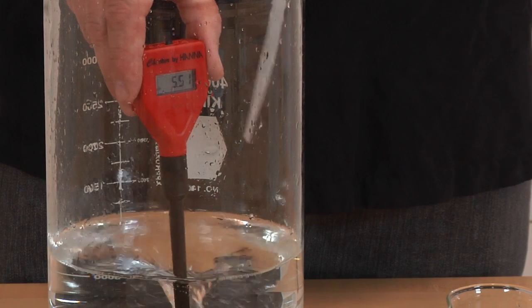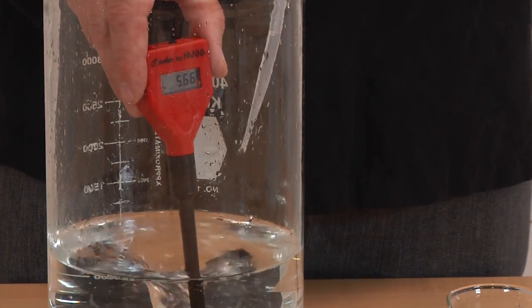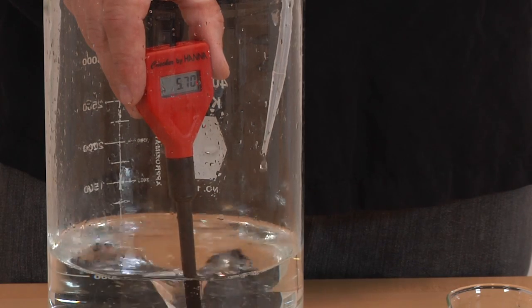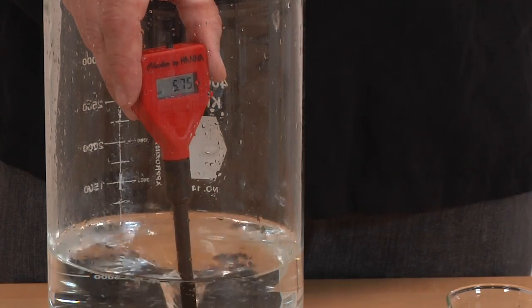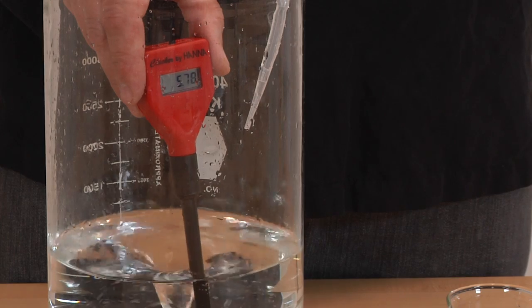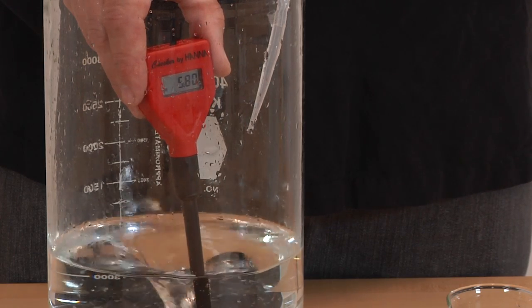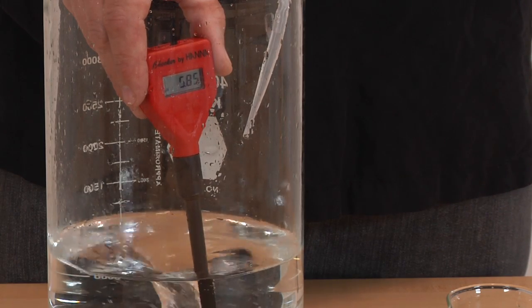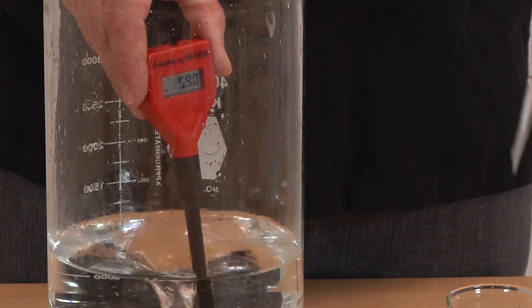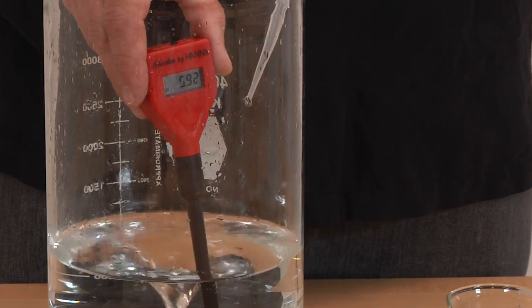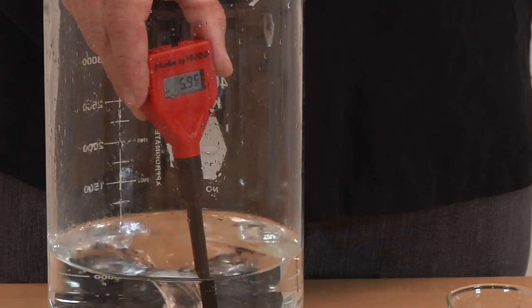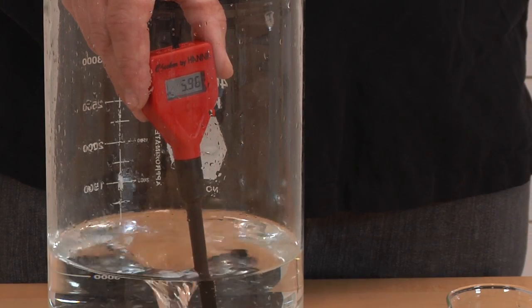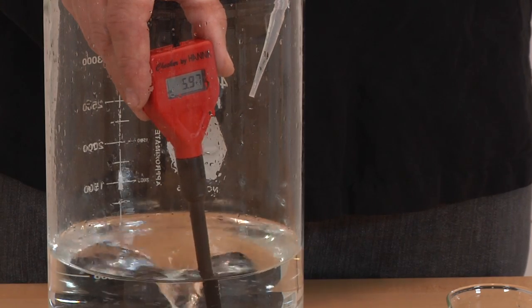So we'll start adding kind of a squirt by squirt. And as we get closer, we'll even go drop by drop. And you can see as we're at the tail end of that buffer range, we're really just taking a very small amount of the ammonium hydroxide to get to our final pH of 6.0.